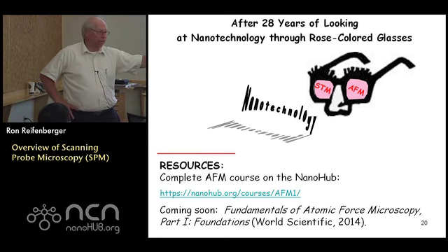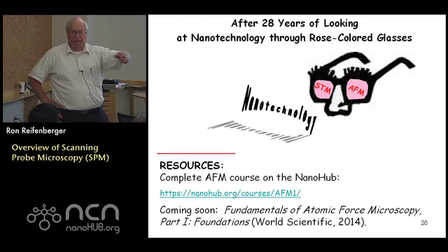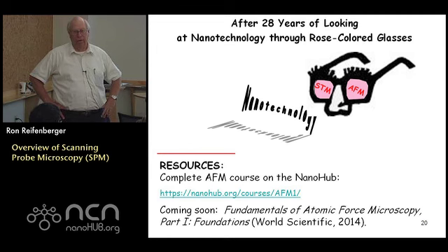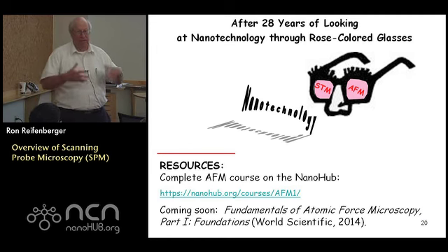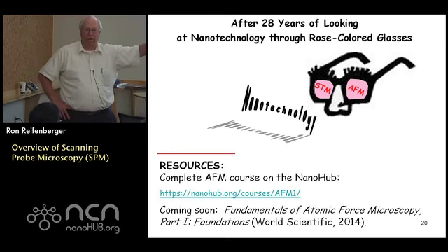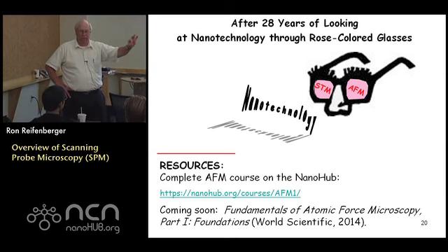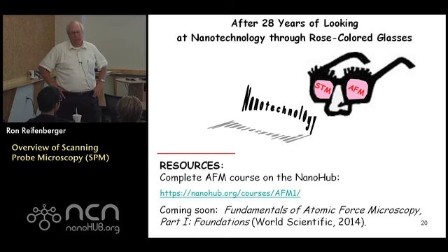Optical microscopes, they've got Raman imaging now, right? Where you can map out a Raman signal as a function of position. That wasn't possible 5 years ago, right? So that's based on optics, but it's a sort of an advanced application. And in the scanning probe world, we also have these specific advanced applications that are tailored by experts to address one particular question. So I think that's common across all the areas, all the branches.